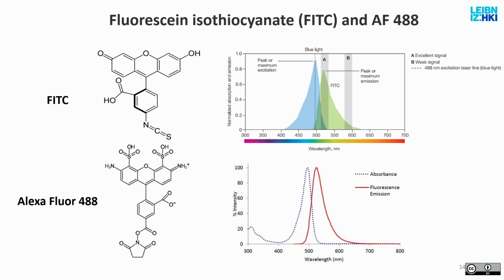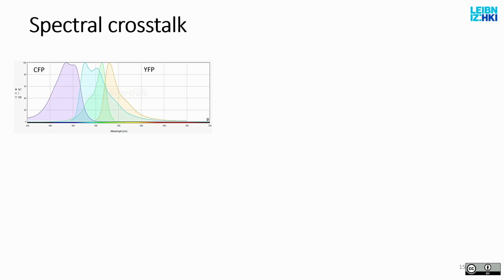This is unavoidable. And then what I was looking for in terms of answer was that if I have three fluorescence labels, I need to know their spectra, not only the peak values of the spectra, to be able to design the experiment.